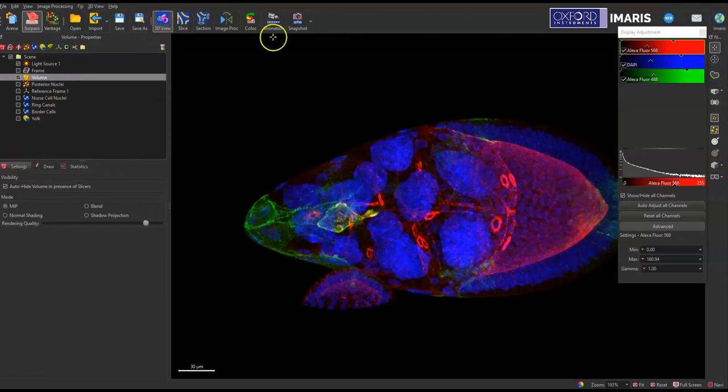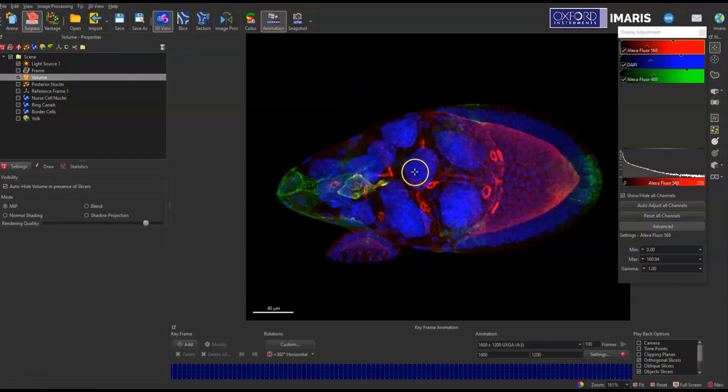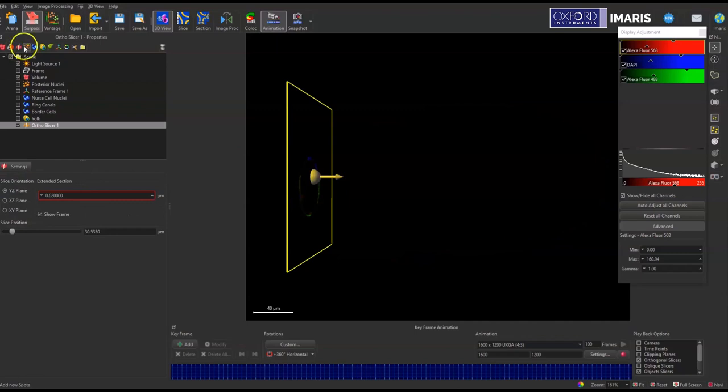So I'm in the 3D view and I'm going to enable animation. And what I want to do is make a Z-Stack that goes through the top to the bottom of the image. So to do that, I need to add a new ortho slicer. That's this icon at the top.